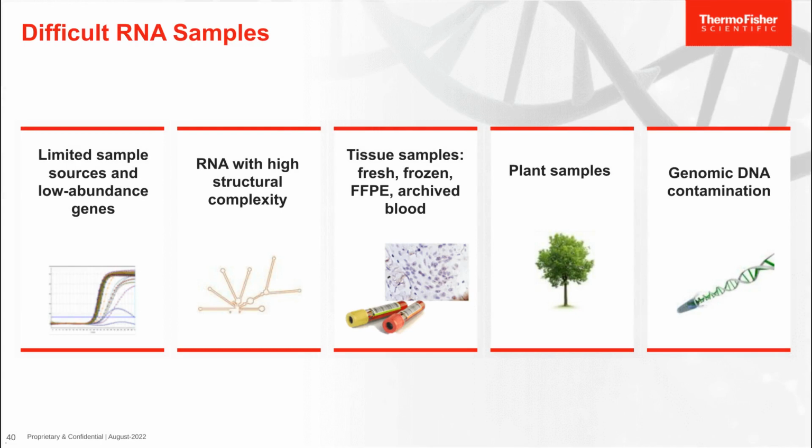I hope you found all of those tips and tricks beneficial for RT-qPCR analysis for animal, human, and plant tissue RNA samples. For our final consideration, let's take a look at one final common issue that occurs with the RT-qPCR workflow across almost all of these sample types: genomic DNA contamination.